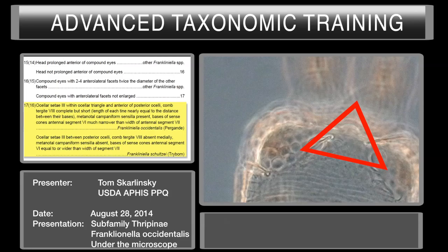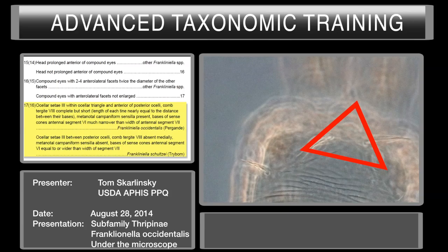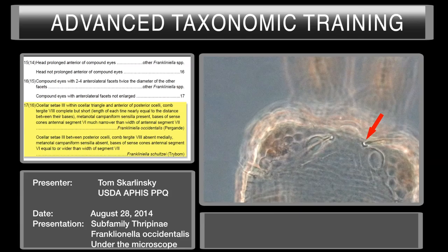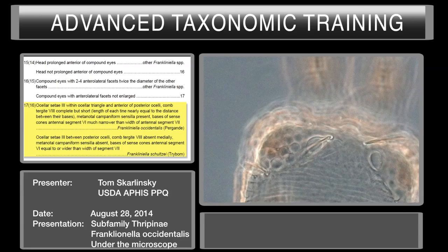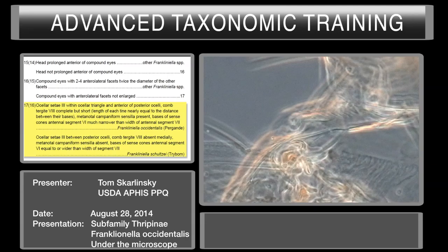Couplet 17: ocellar setae three - where is it? Is it within the ocellar triangle? The ocellar triangle is this area if you draw a tangent from ocellus to ocellus and the outside. Are the ocellar setae three within this triangle? They are within this triangle. Are they anterior of the posterior ocellus? Just slightly. So they're within this triangular area and are just anterior of it.